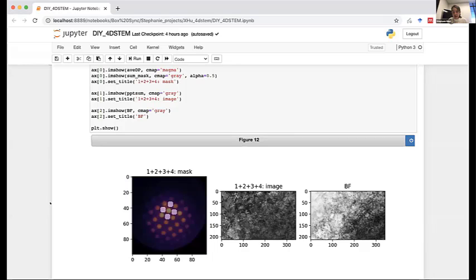And just before we conclude this section of the code, I'm going to take a quick detour to talk about plotting. One value in Python is that you can have a lot of control over how you're actually plotting your final image. That's maybe interesting for aesthetic reasons, but also very helpful for starting to understand and analyze your sample.